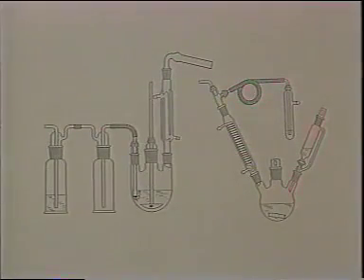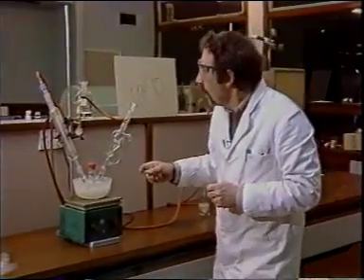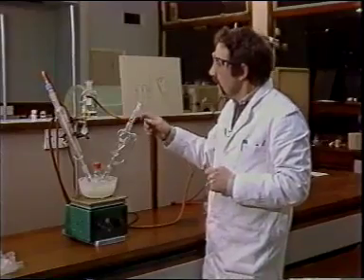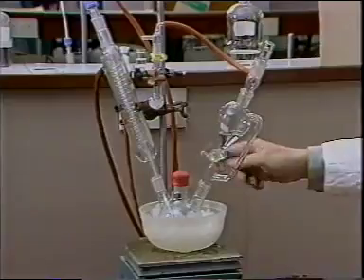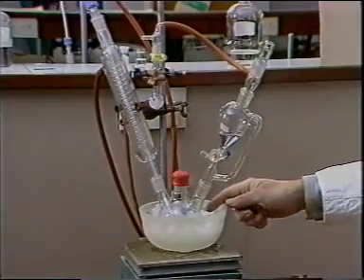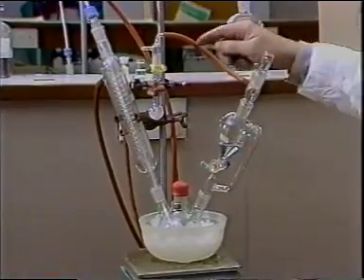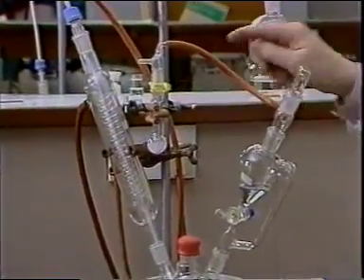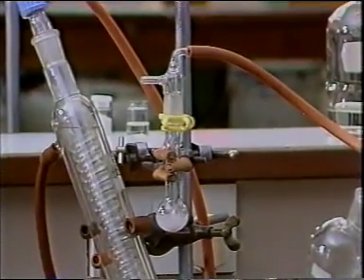The second diagram shows agitation maintained with a magnetic stirrer, as we see in the setup we have here. Once again, we have a positive pressure of nitrogen entering the apparatus here, passing down through this PTFE tube into the reaction mixture, and escaping from the apparatus through this oil bubbler, which is even more efficient at maintaining an oxygen-free atmosphere than the guard tube.